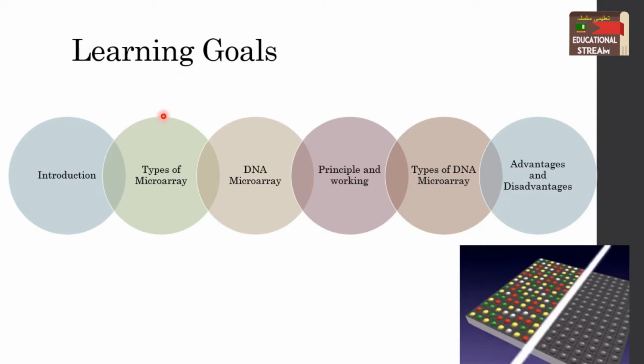In this lecture, first we will study about the microarrays, a brief introduction of the microarrays, then types of the microarrays, then our focus will be on DNA microarray, principle and working of DNA microarray. Then we will study about the types of the DNA microarray and what are the advantages and disadvantages of DNA microarray.